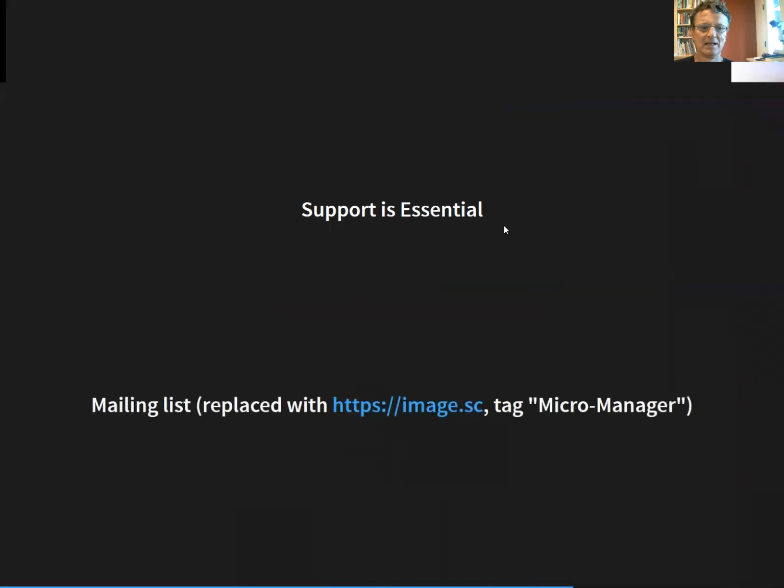Support with projects like this is extremely important. So the first thing is an installer. There are installers on Windows and Mac that make it extremely simple to get the application to actually run, which a lot of projects have problems with.